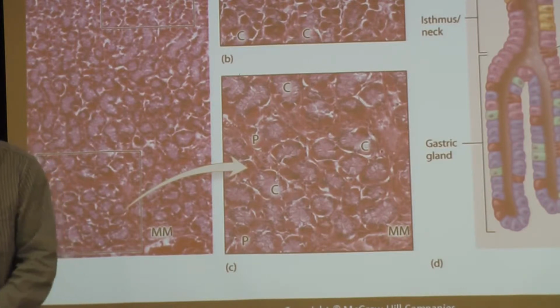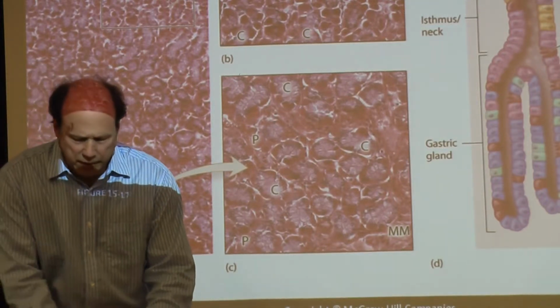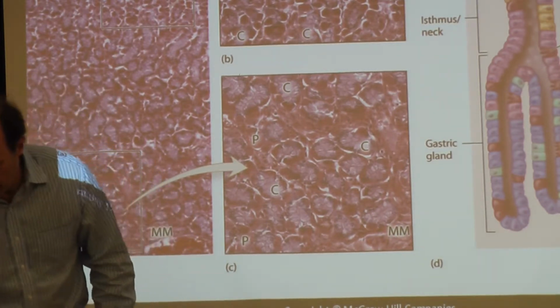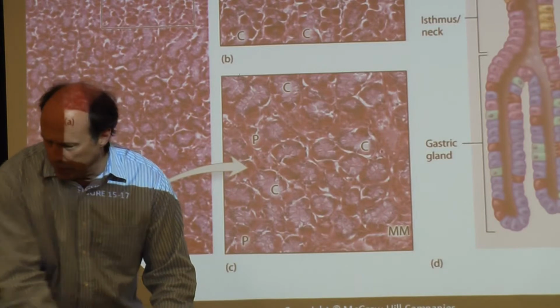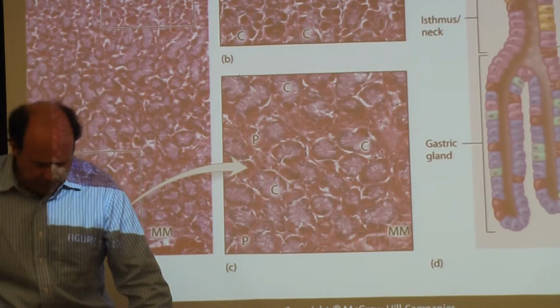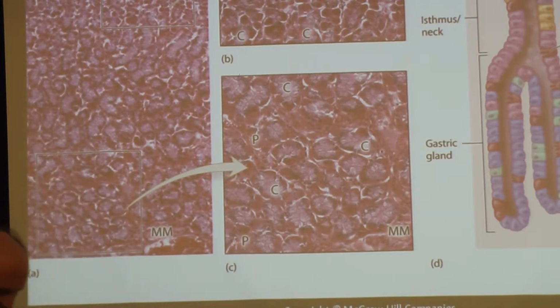Okay, that's pretty good, I think. So let's get set up on the lab. Take out microscopes, and I'll come down with these sections for you guys to analyze. Any questions about this stuff?